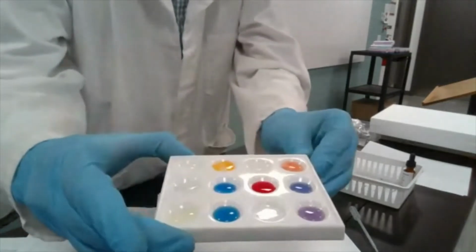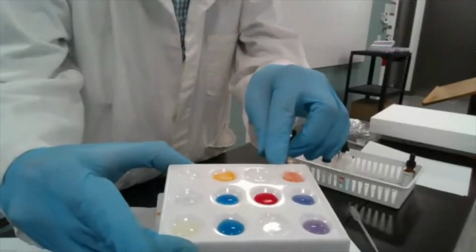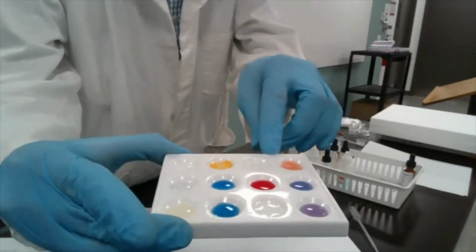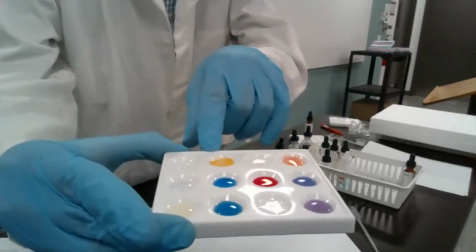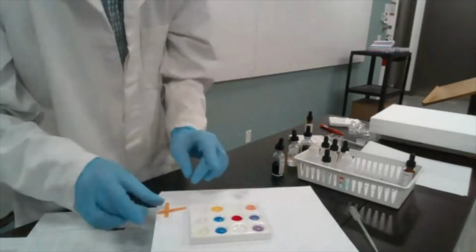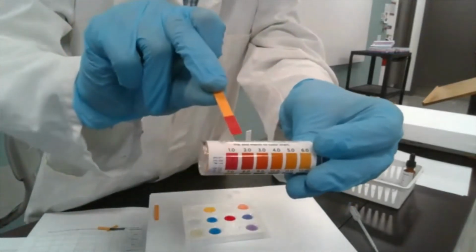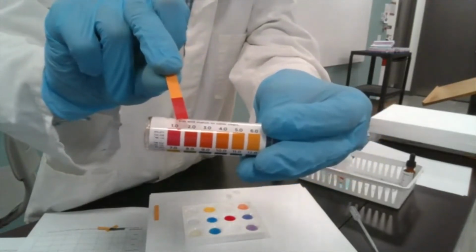Again, if we look at these samples here, the last one that's closest to me, you see that this blue litmus turned red. It may look orangish to you, but it's actually reddish. Phenolphthalein remained colorless, and bromothymol blue turned yellow. Let's use another strip of the universal indicator and see what it tells us. Again, quite a dramatic color change, which to me looks like somewhere between 1 and 2. You can write probably closer to 1, but you can write either.